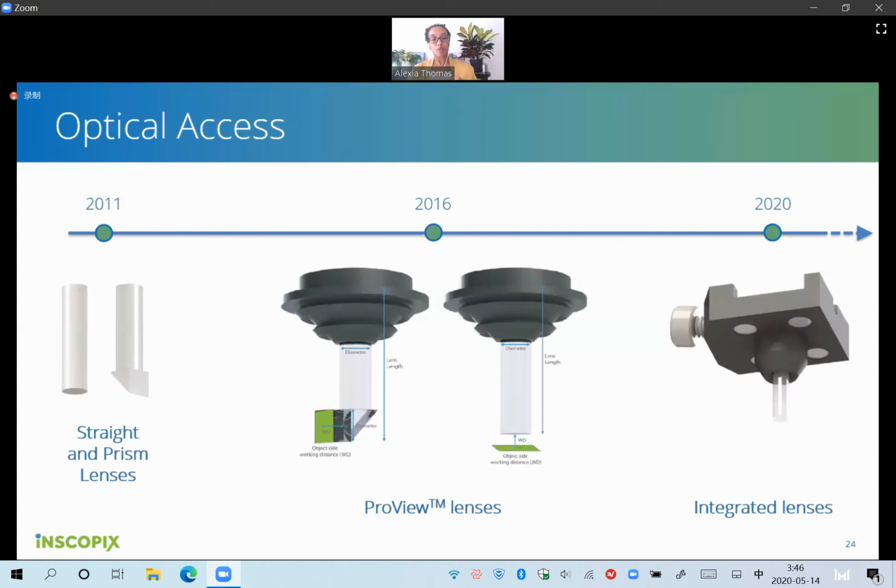Sure. So if you look at our software, Inscopix Data Acquisition Software, or IDAS, the lens focus UI you see there is from 0 to 1,000. That actually linearly extrapolates to what is the focus for the microscope, 50 microns up to 350 microns. But when we're talking about the lens itself, when we're doing in vivo imaging, that translates to 0 being 0 and all the way to 1,000 being 300 microns, basically. So it's a linear relationship. Oh, that makes a little more sense.